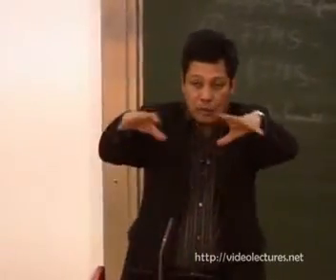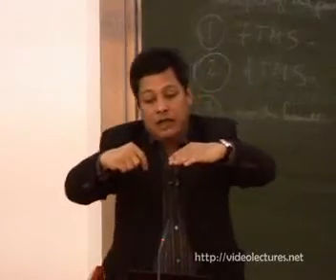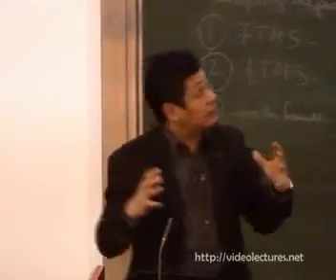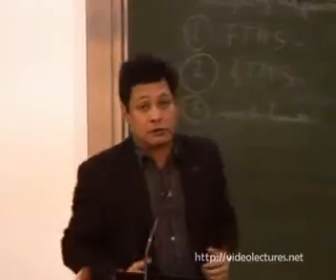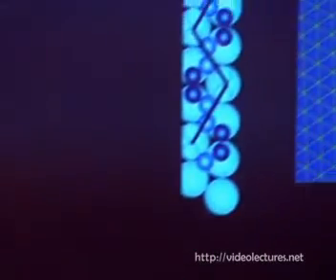But if we want to get atomic resolution on the surface, we have to approach the tip. We try to move it, then the molecule also moves away. So we don't get the molecule together with the atomic resolution. It's difficult to get. So again, we use atomic manipulation to position the atoms on the surface.